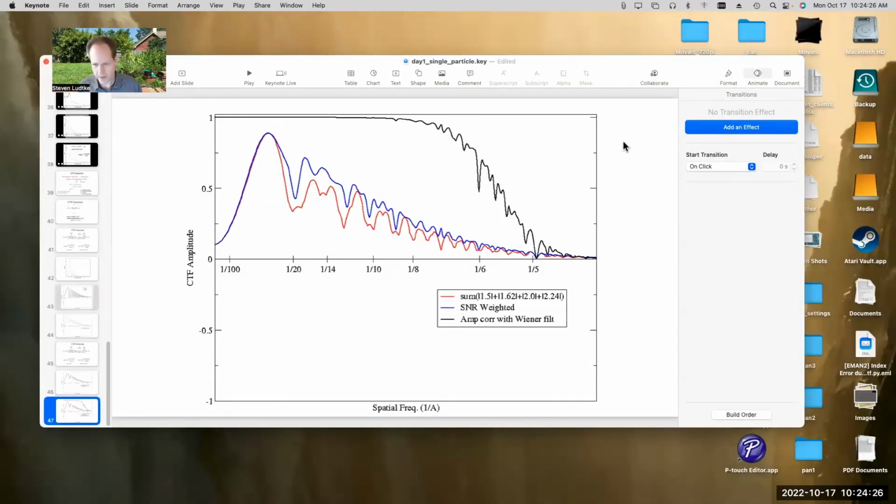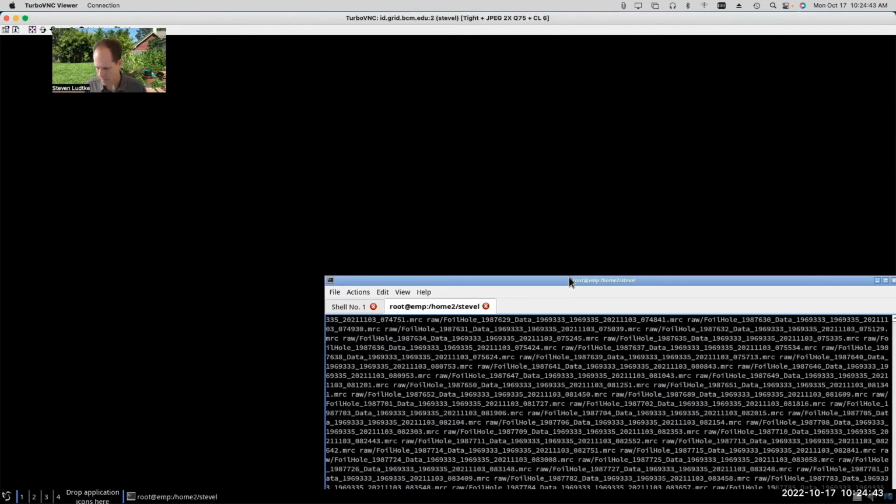Okay, so that was the little talk. I just want to spend a couple minutes now looking at some real data, and then I'll take some questions. And I realize we may run over an hour just a little bit, but that's fine from my perspective. Feel free to leave whenever you need to.